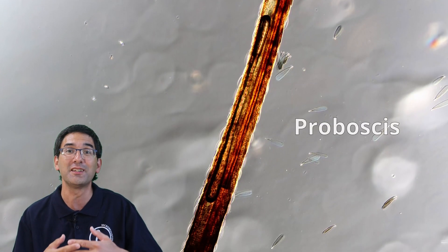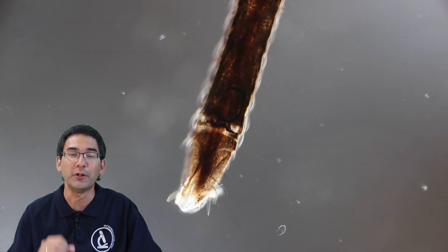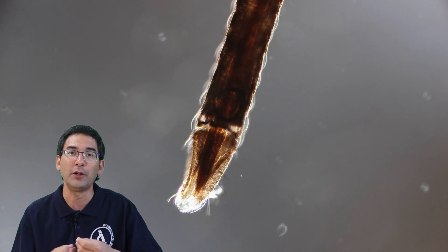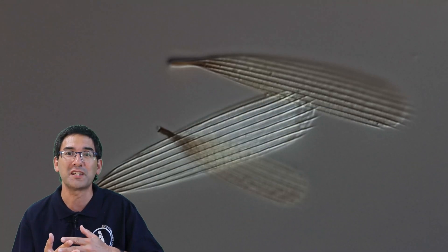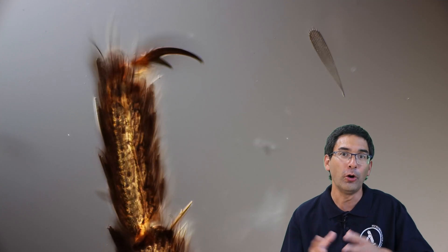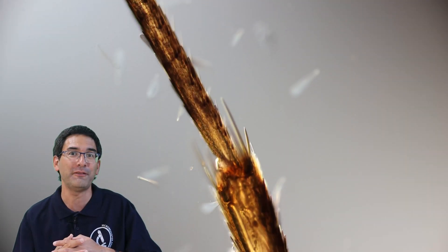This here is the so-called proboscis — the trunk of the mosquito used to suck blood. If you look very carefully, you can see tiny scales on it. It's not one structure but actually several. Unfortunately I was not able to get more detail because the exoskeleton is relatively dark. Here again are some scales in close-up — they are a little bit more transparent. Normally you have to use certain chemicals to bleach and brighten the insect to make the structures better visible. This is one of the claws of the legs, with a small scale next to it.